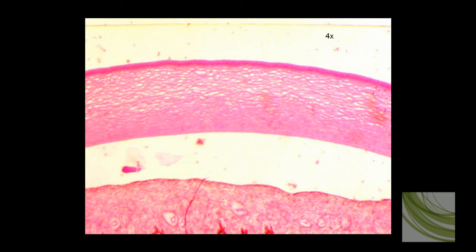Now we're going to look at the cornea and the ciliary body of the cat eyeball. We're using the 4x objective here. Now we're using the 10x objective on the cornea, and we can see a little layer of stratified superficial cells. We can see this basal layer of cuboidal cells, and then all of the stroma of the cornea.